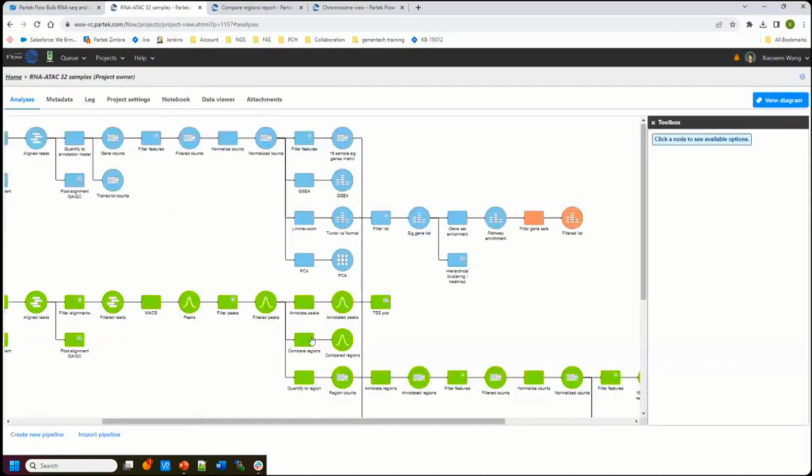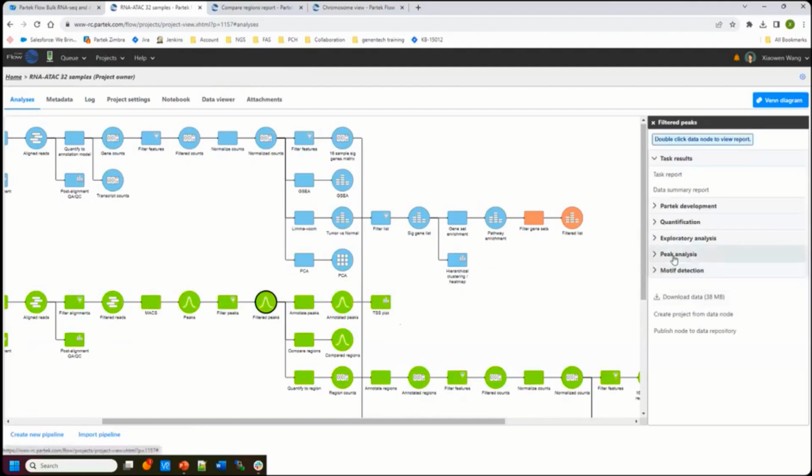when you only have a few samples, what you can do on the peaks. In our case, we have a tumor versus normal. I do have 8 replicates for each phenotype, and I want to do the comparison. Give me some statistics. If that's the case, you need to quantify the regions. So basically, if you want to compare across samples, you have to make all the regions line up for every sample, just like genes, right? So we will perform quantify regions.